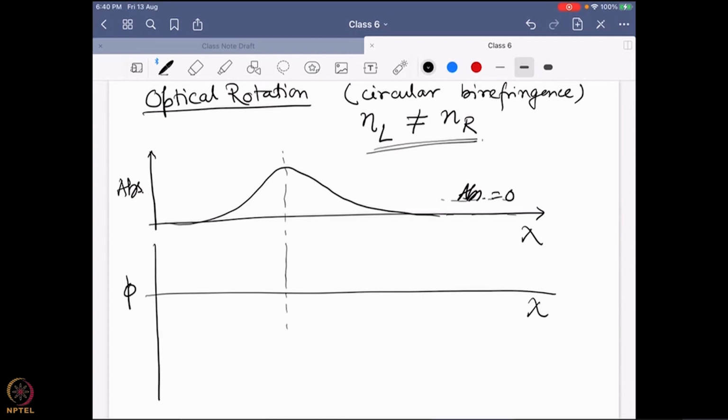However, what was found by the scientist named Cotton, very uniquely, is that the optical rotation is dependent on the wavelength in the following way. One particular enantiomer showed data like this. The significance of the dotted line I'll come to later. But importantly, they found that at the maximum of the absorbance, the optical rotation value is actually 0.